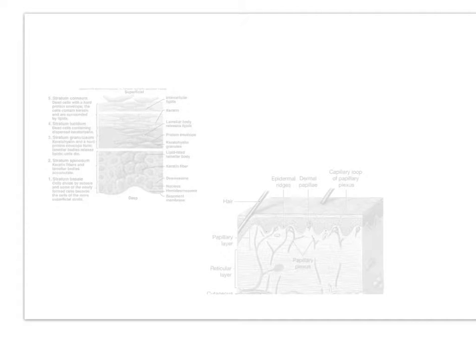epidermis, and then you see all of those hair shafts into the dermis, and you also see down there at the bottom below all those pink shafts of hair, the hypodermis at the very bottom. And then at the very, very bottom, there's a layer of sort of darker red, and when we zoom in, we'll take a look at what that is, okay?